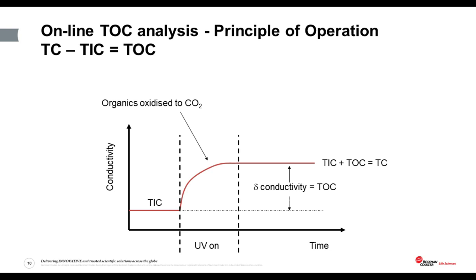The carbon dioxide from the oxidized organic material and the inorganic carbon dioxide now add together to represent the total carbon present in the water, or TC. And then the Pharmacopoeias ask that we subtract the TIC from the TC to calculate the total organic carbon, or TOC.